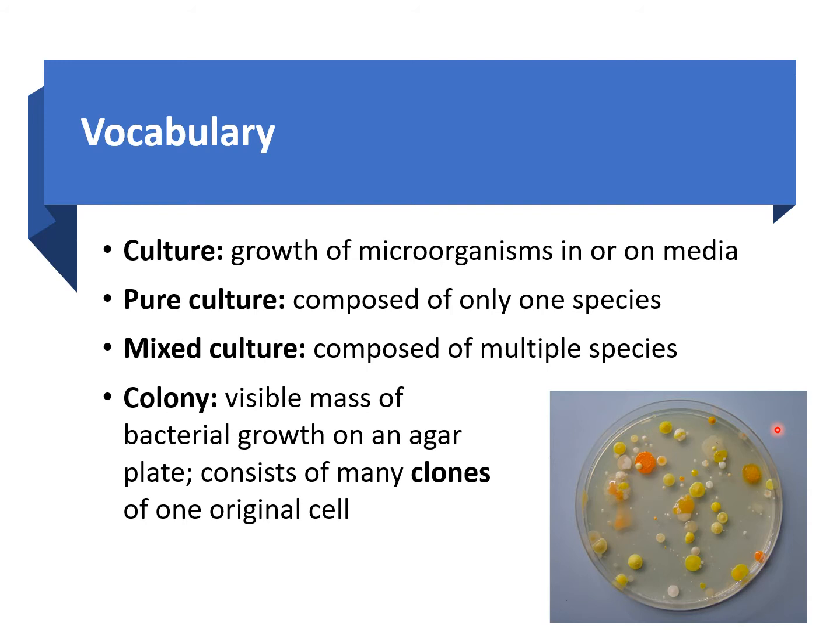You can also see variation in texture. Especially if you zoom in on the plate, you might notice that some colonies look wet or shiny, and some of them look matte. So texture-wise, there could be a difference, and you can see some differences right here. See how this one is more shiny than this colony right there.